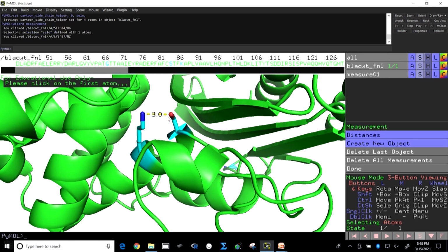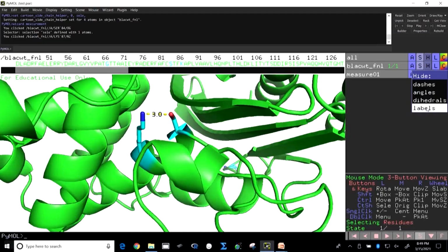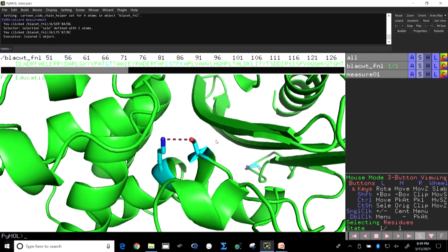So, when you do that, you could see that in this case the distance is 3 angstrom, which clearly shows that these two amino acids are in non-covalent interaction, which is hydrogen bonds. And if you remember, I am repeating again, you will not take the name or the colors which are given here, you go back and do it in the PowerPoint. You could make it a ruby color, generally default, but do not put the distance.